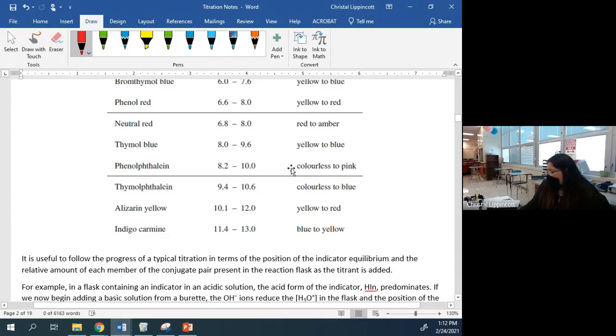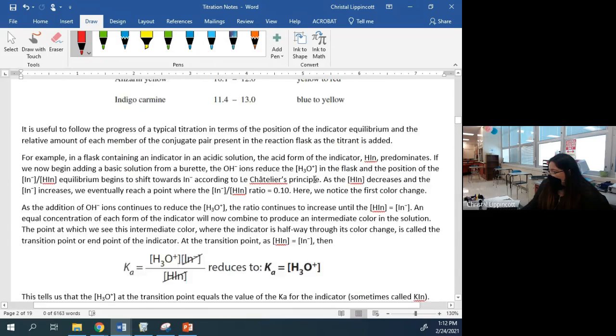So you'll be taking the pH, and what you're looking for is the point where this increases the pH, and then eventually you get to a point where it goes straight up and then it'll level off here. You're looking for that straight up section, and that's what that derivative helps you find. And so you'll be using pH meters to figure it out and then do some math.